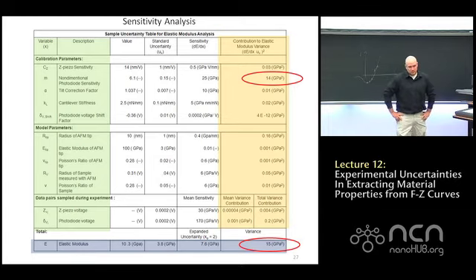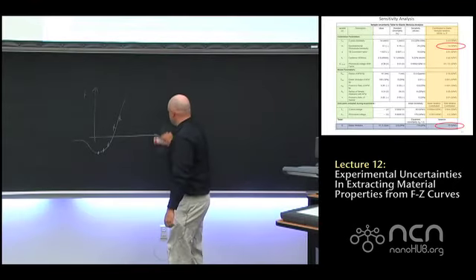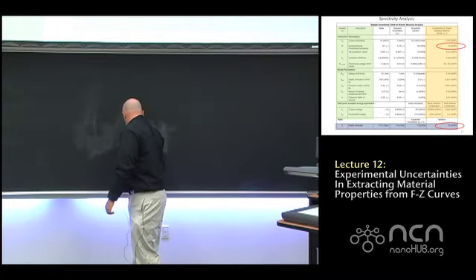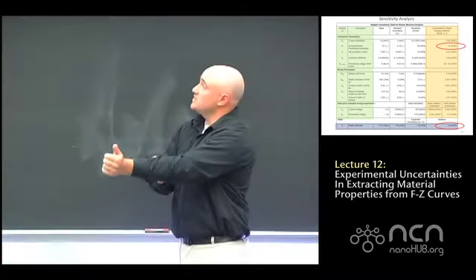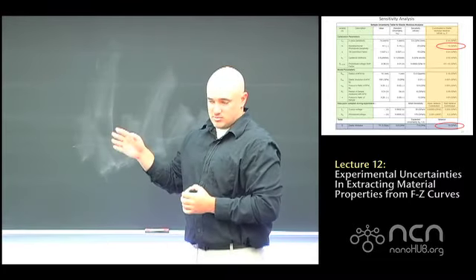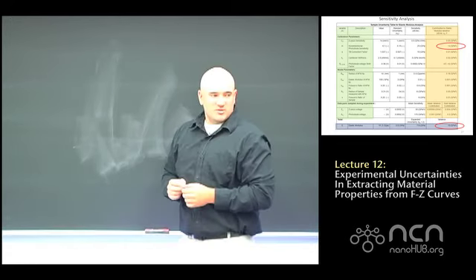So, why is that? This is my last slide, but I write it on the board here. So essentially, what we've shown is that the sensitivity is really high for this M parameter. And does anybody have any guesses about why that might be?